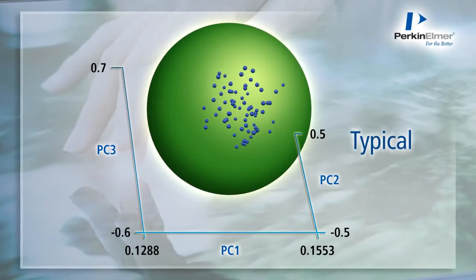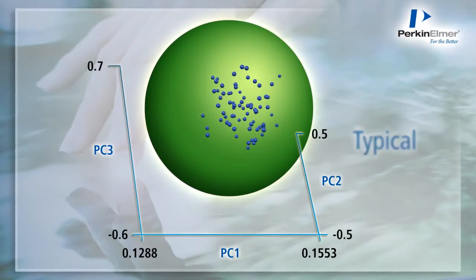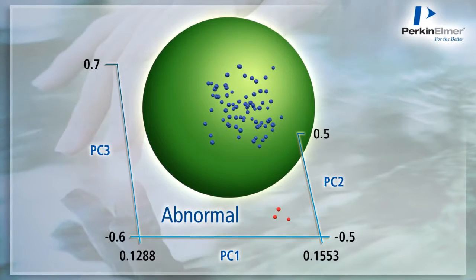And that leads to the second method. Now, the real strength of near-infrared spectroscopy is that the spectrum is characteristic of the whole sample. So we can build a qualitative model for what normal milk powder looks like, and then look for deviations in the sample spectrum. This lets us do non-targeted screening for any adulterant, not just the ones we know about. The disadvantage with the second approach is that because we're not using any information about the spectrum of the adulterant, we don't get the same level of sensitivity as a targeted quantitative method can achieve.